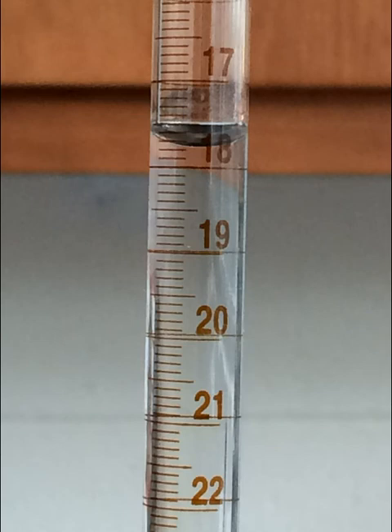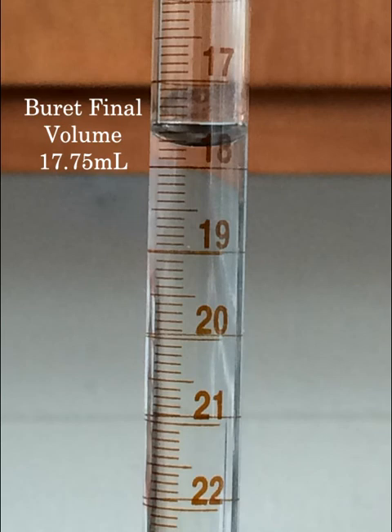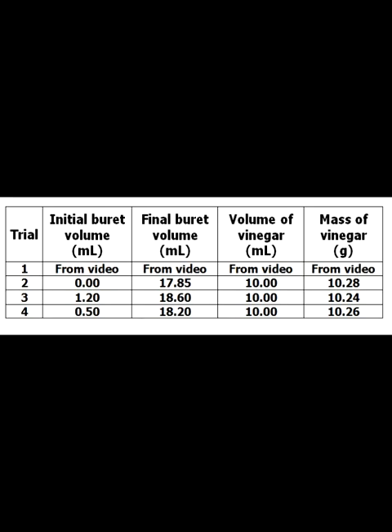The final volume in the burette is now recorded. The solution is then discarded, and the experiment is repeated for multiple trials, in this particular case 4 separate trials.